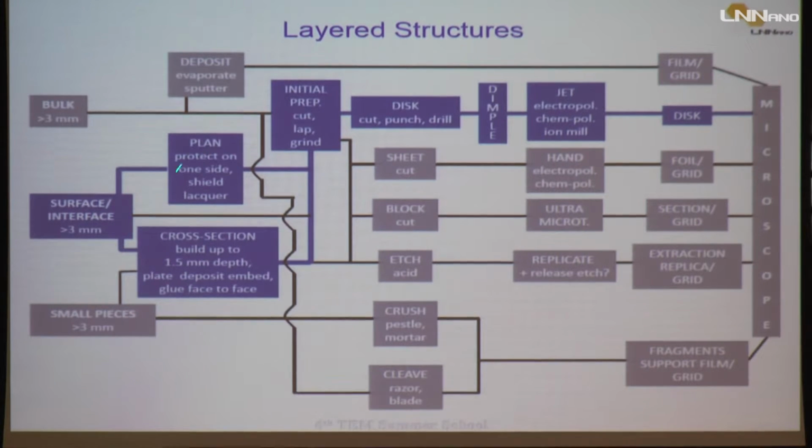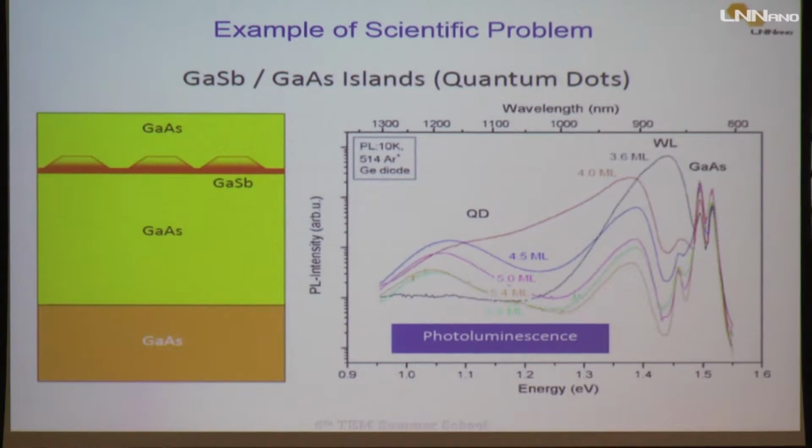With a layered structure, you may be interested in the surface, or in cross-section analysis. And then I will show something, a preparation of a quantum dot in a semiconductor, okay?